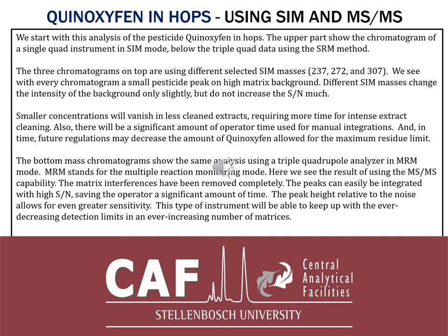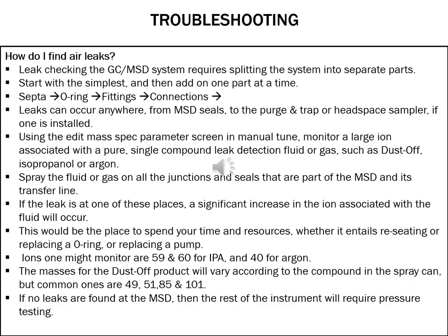This slide here explains the previous slides about the quinoxyfen, for the single quad SIM and for the triple quad MSMS. It's self-explanatory. The remaining slides from this one where we are now, I think it's 45 up until 48, are some troubleshooting guides for you when you're experiencing problems.